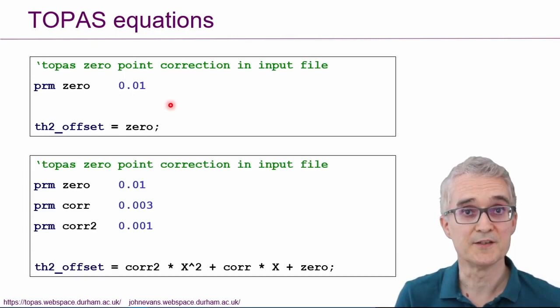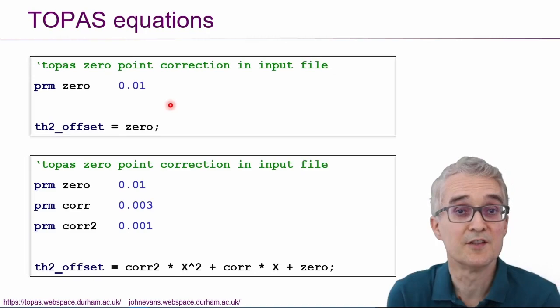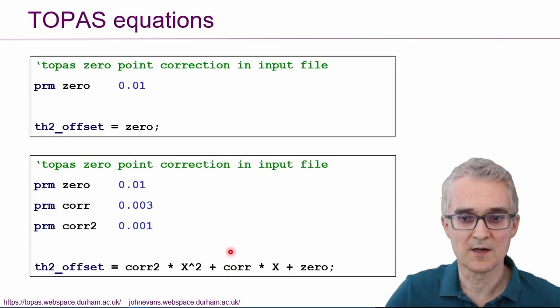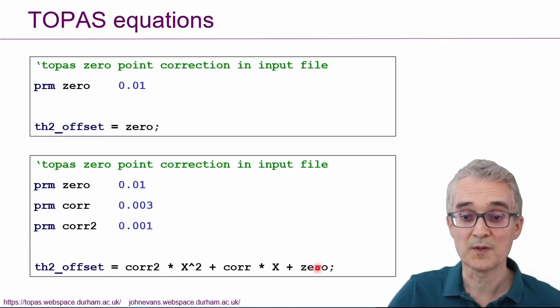So that was a way of just repeating what one of the built-in macros in TOPAS is already doing. But you can very easily see that perhaps it might be that for your particular diffraction experiment, a simple linear offset in 2θ isn't going to be sufficient to describe your data. So you could imagine writing a slightly more complex example, like at the bottom of the screen here, where instead of just describing a parameter called zero, you have two extra parameters defined called corr and corr2. And you could feed those into a simple polynomial, which says to TOPAS, the 2θ offset is something times 2θ squared plus something times 2θ plus a constant.